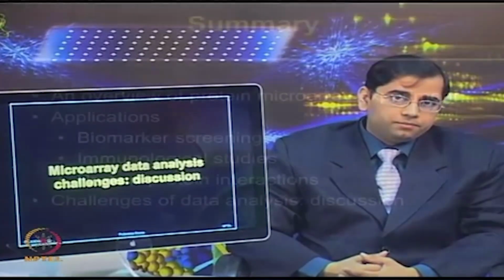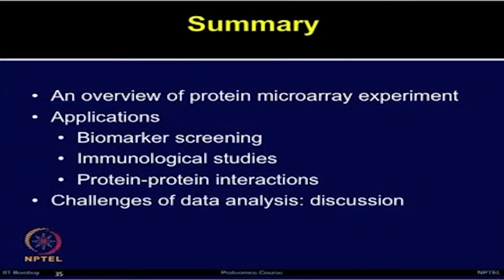So, in summary, protein microarrays offer a novel technology for the simultaneous and rapid analysis of multiple biomarkers or interactors in a high throughput manner. Microarrays have been widely used for detection of antigens as well as antibodies in blood samples and various other clinical samples.